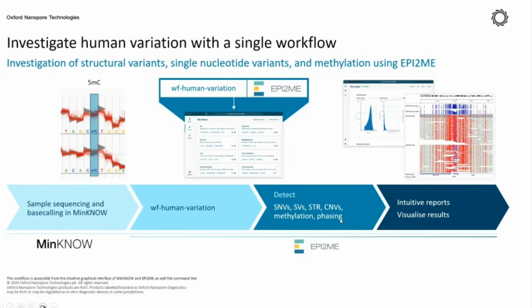So in some cases, we would also like to know whether the variations come from either side of our parents. In normal experiments or short-read sequencing, we normally need to sequence three samples, the trio samples, the parents and also the proband, in order to do the haplotyping or the phasing. Because Nanopore can handle long-read sequencing, we are able to also perform physical phasing.